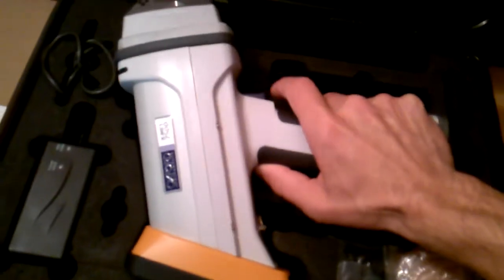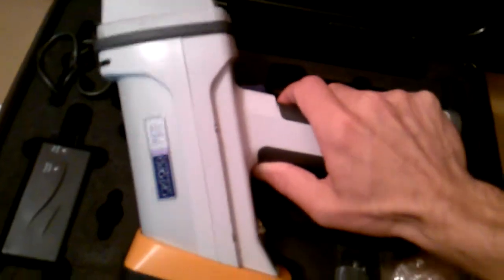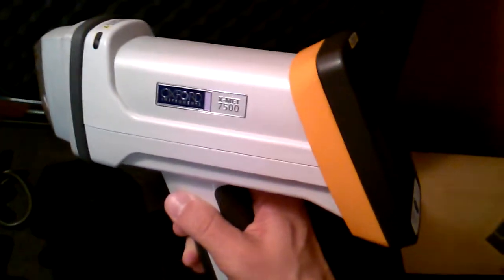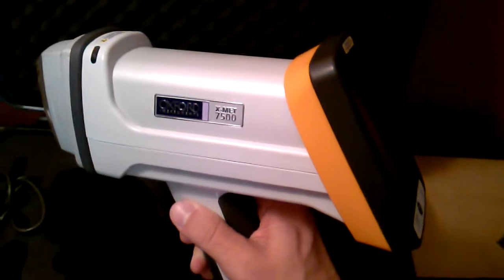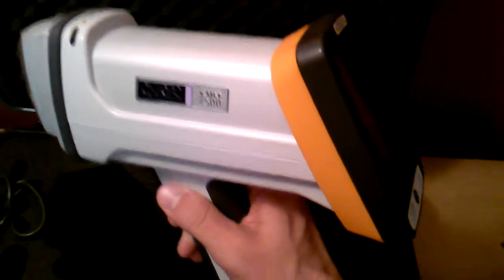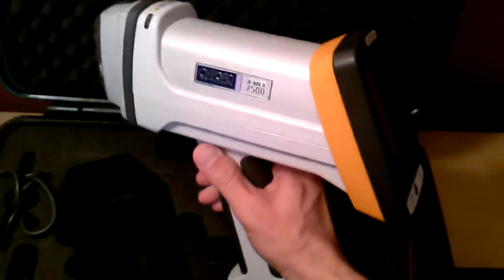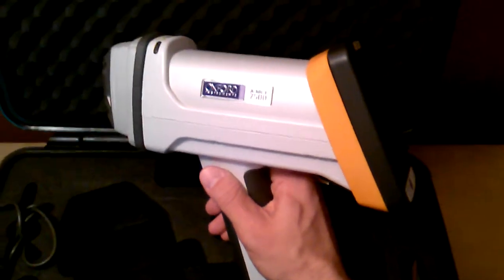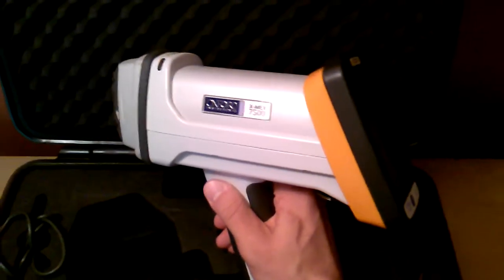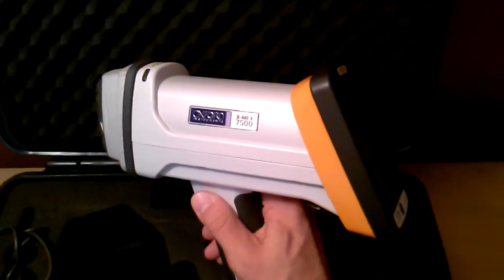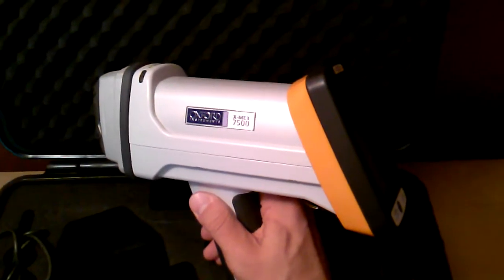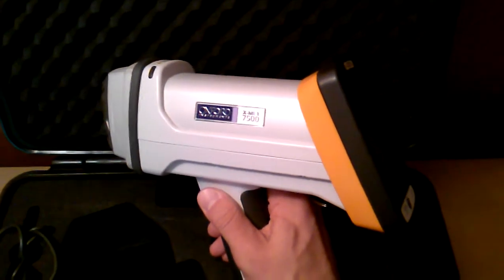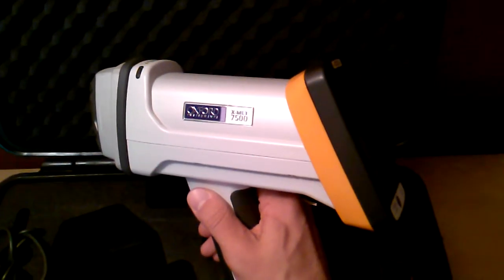In the XMET 7000 series this is the XMET 7500. Great system for light element and alloy analysis or light element analysis. Comes with a variety of empirical and fundamental parameter software packages, calibrations added.